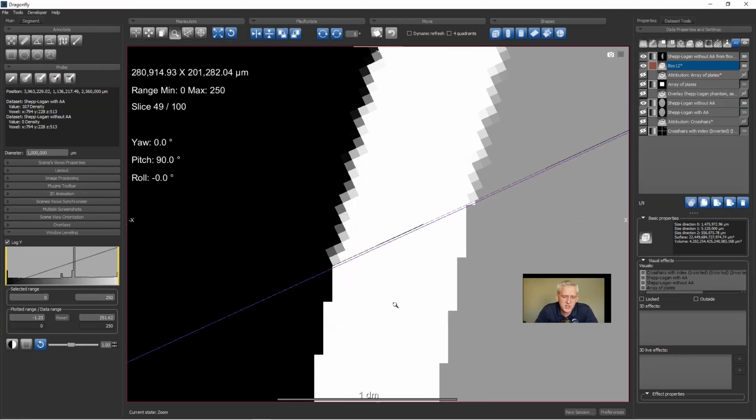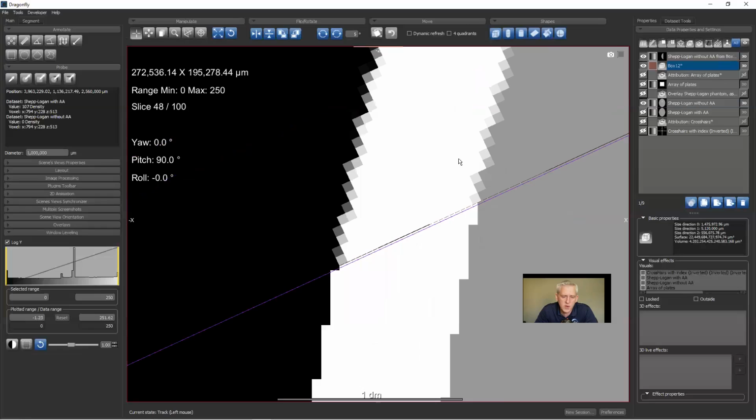And so now you see that instead of going from 0 to 250 to 150, we have to have some pixels on the interface. This is absolutely required. There's no way to get the source geometry the same, that is, maintain this shape on this new pixel grid, without introducing some sort of interpolation.